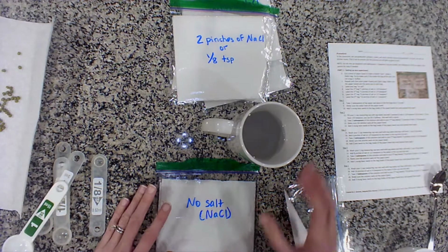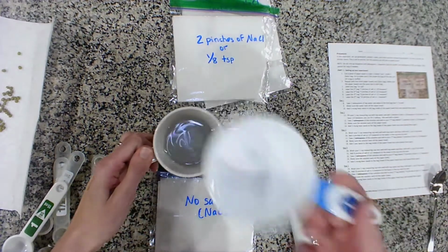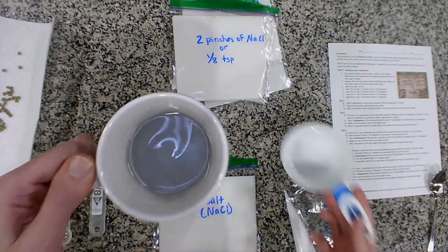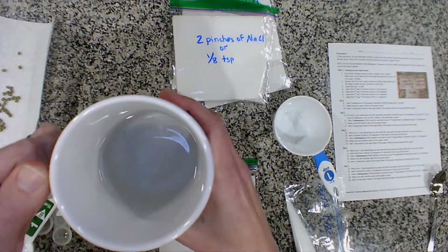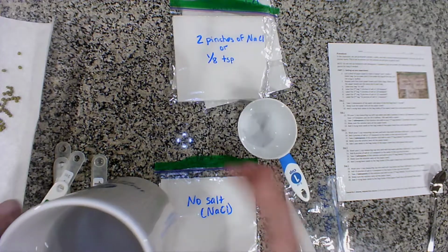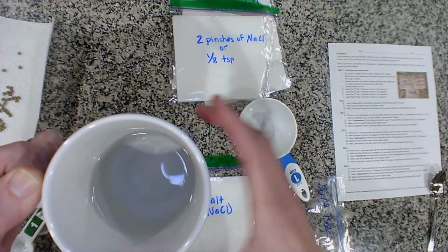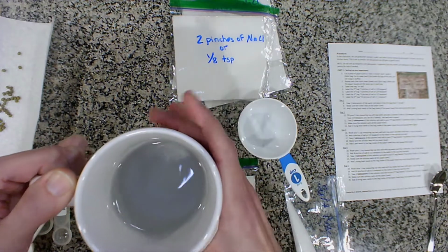All right, let's go ahead and get started on setup for bag 1. I went ahead and got just a cup of tap water and I poured it in this mug. Now this is a tall mug and it's about halfway. So if you don't have a 1 cup measuring cup, then just fill this up about halfway. If you have a shorter one, it's maybe about 2/3 of the way up.